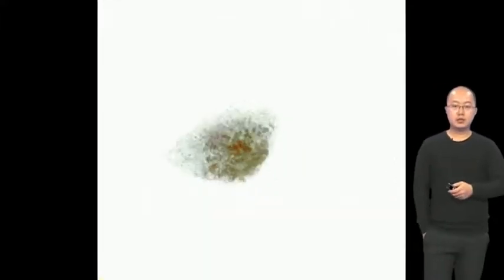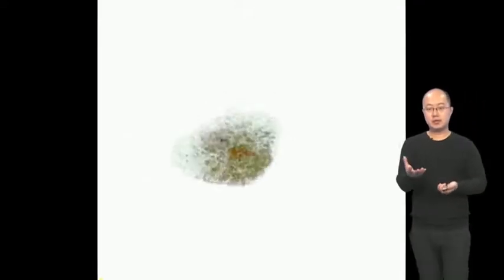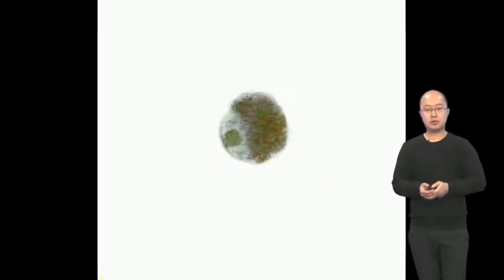And this is one example of 4D. So this is a HeLa cell, which was attached to the glass substrate, and by adding trypsin, those cells are detached from the substrate. So you can see that the cell becomes spherical, and it just pops up.